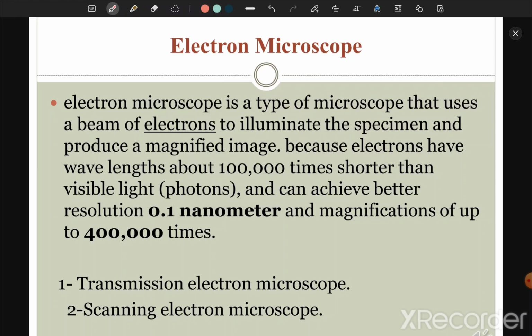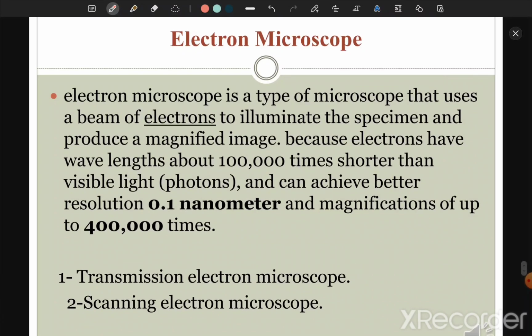Plus there is another difference besides the steps of tissue preparation: the instrument that is used, the microtome, as in the practical session. This is the instrument which is responsible for sectioning the tissue after preparation. Our microtome is different. The microtome in the case of the light microscope has a steel blade. For the electron microscope it is a knife of diamond or glass.